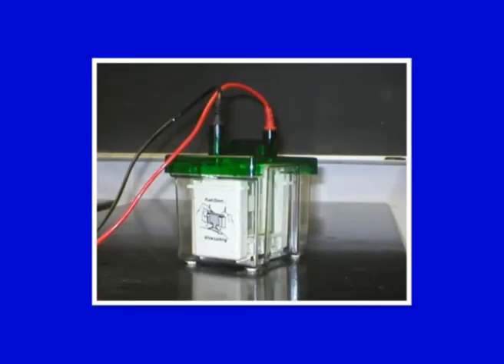Likewise, tube gels could be run here, where rather than a slab gel or plate gel, you will have a tube and only a single sample could be run. The whole apparatus looks something like this. You have an enclosed buffer chamber and these are the electrodes, 2 electrodes here. The gel apparatus is kept in here, and as you switch on the electric current, protein migration will take place and separation will take place. After the protein has been run, you can remove the gel plates from here. Gel plates could be separated and the gel could be put in a staining solution, like a solution containing Coomassie or any other dye, and the bands could be visualized.